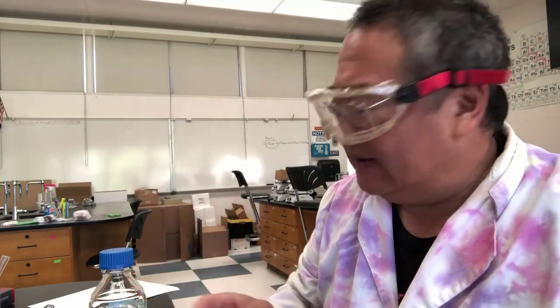And then when you store it at your desk, you'll use what's called a watch glass, and you'll learn some of these things as the semester progresses. You put a watch glass on top so that the liquid doesn't evaporate out, okay?